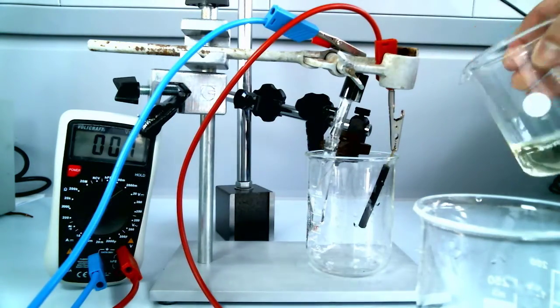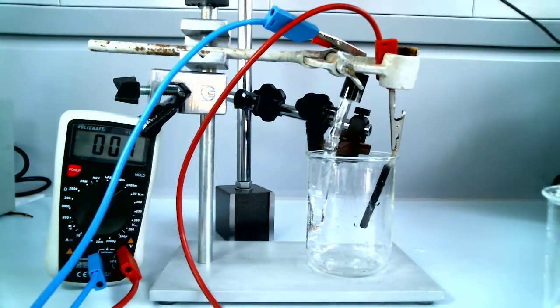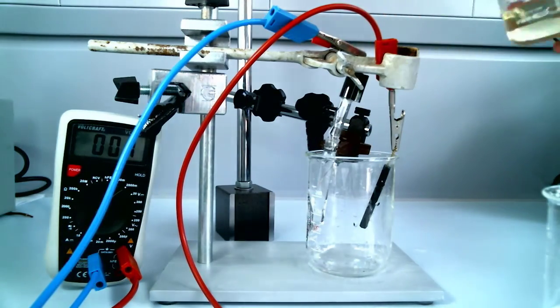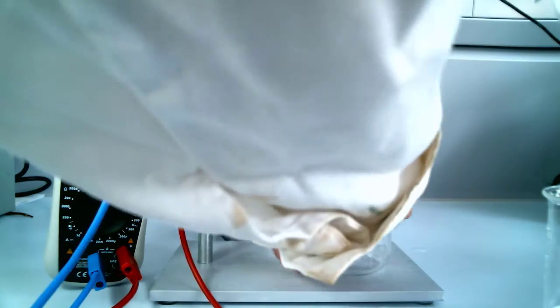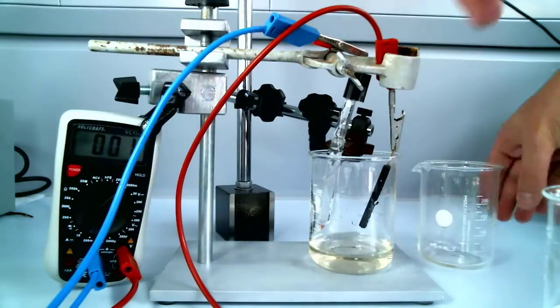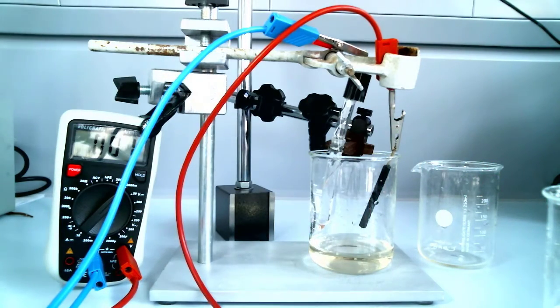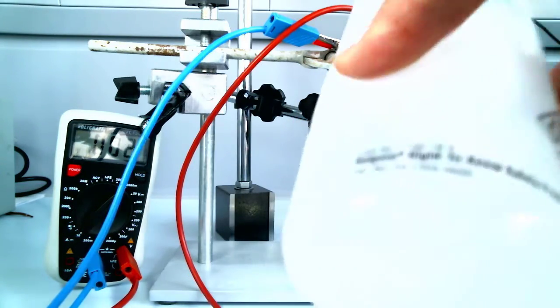We're first of all going to add iron 3 sulfate, measure the voltage, and then add iron 2 sulfate, and then we're going to add a complexing agent. So first of all, the iron 3 is being added. By the way, this is all at slightly faster than normal speed, because it takes a long time in the lab. So here I am going to add some water to it to get it all wet.